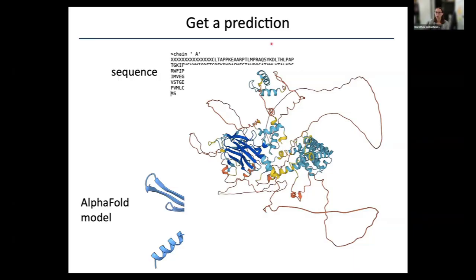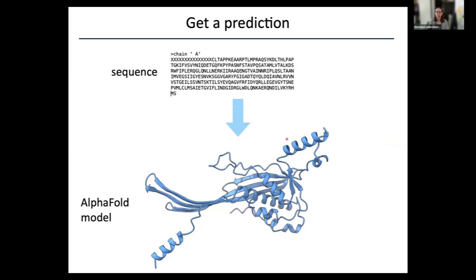So this is what our collaborators from the Richardson lab call, oh yeah, I forgot the name, barbed wire. This is just a line of main chain that hangs in space. So here visibly, this looks kind of odd. And the prediction we have here doesn't have this kind of pathology or this kind of oddity.